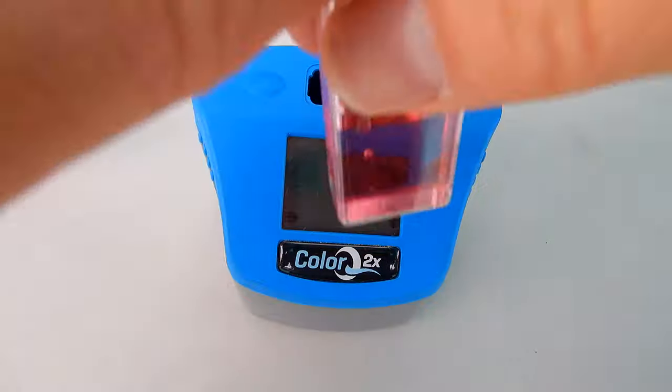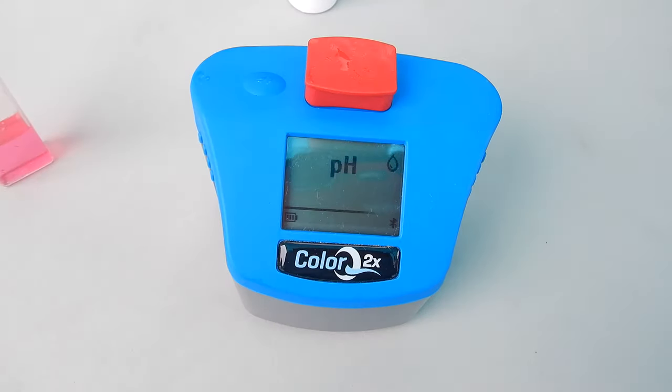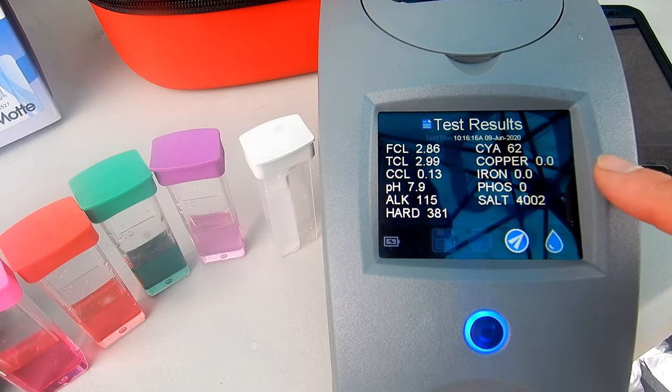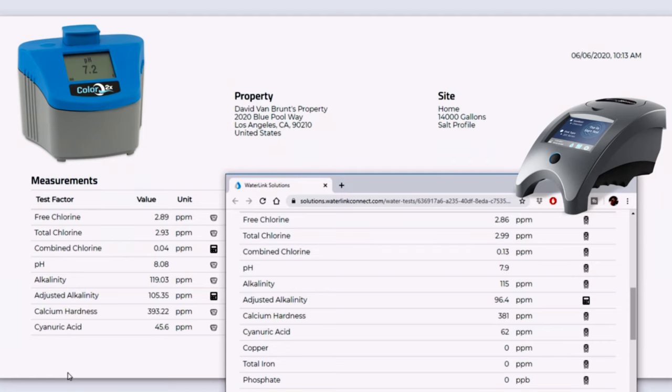I ran the ColorQ 2X Pro 7 through a series of test factors and I'm going to compare these results to the LaMotte Spin Touch — the premier photometer on the market today — to see how closely the results match up between the two photometers. Here's a look at the two readings: the one on the left is from the ColorQ 2X and the one on the right is from the Spin Touch. You can see that the results match up really well using the same water sample with two different digital testers.